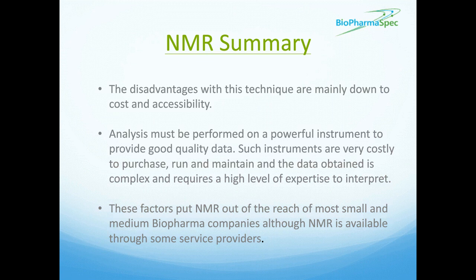But after that, once you prove similarity, you will then go on and use some of the other techniques that I'm going to describe as we go through to continue along with the comparability side of things. And this again fits in with the analytical funnel idea of trying to go from all tests to tests that require to give well-defined analytics and can be used relatively easily and simply.